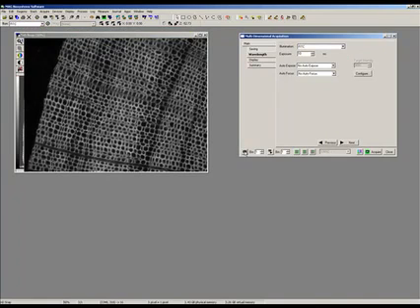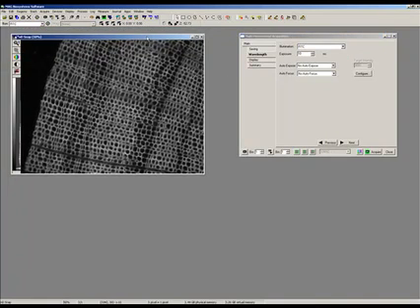That image changes, so I don't have a second window. So that's only a preview to go and have a look, to control the shutter, to allow me to see what's going on without bleaching my sample too much.